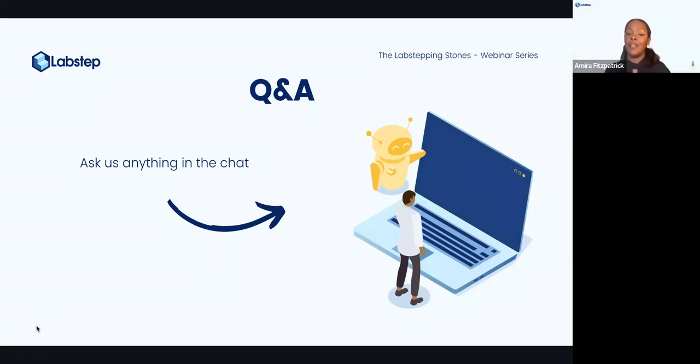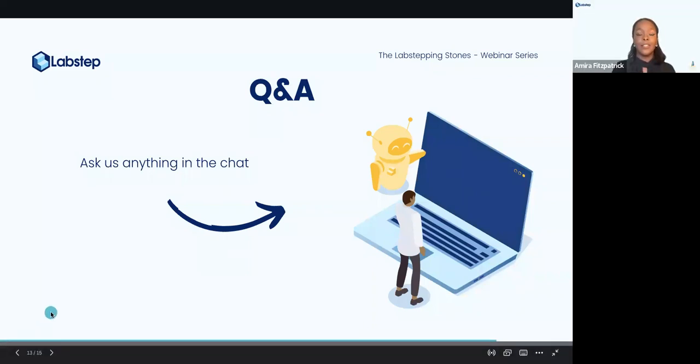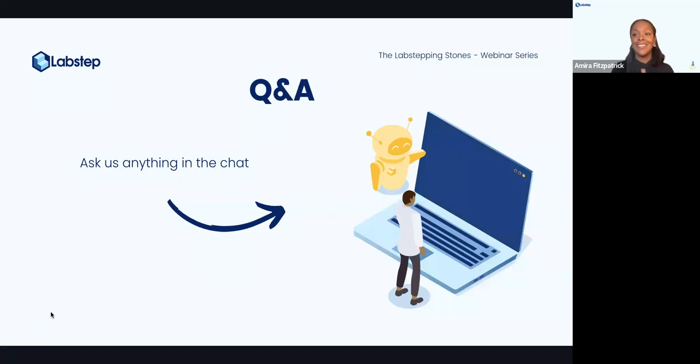Charlotte, I don't know if you can give us a little bit of insight into just how cool these automated softwares really are, having a bit more experience than Ethan and I. Sorry, specifically what ones? Yeah, just anything. I mean, just the world of automation. It's so new to us that we're eager to learn.